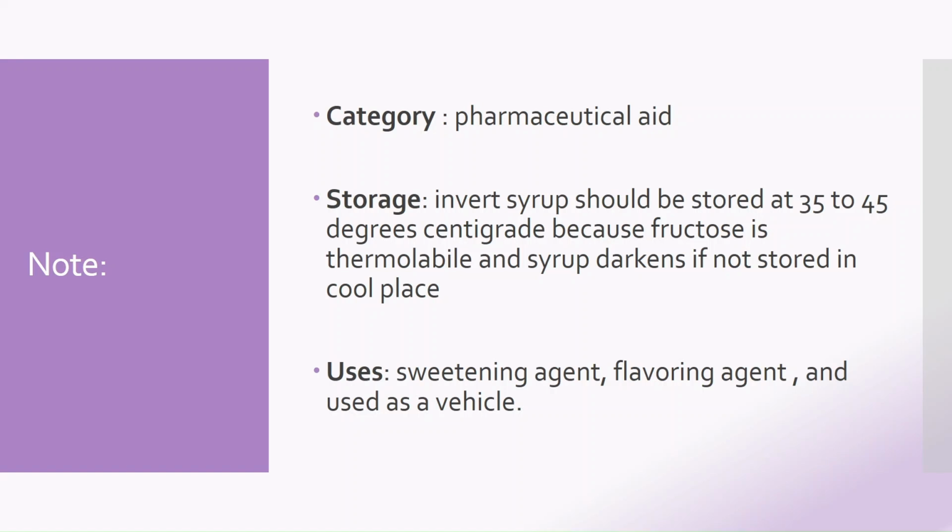Invert syrup should be stored at 35 to 45 degrees centigrade because fructose is thermolabile and syrup darkens if not stored in a cool place. So these are storage conditions that you put on your label after you've packed your preparation.